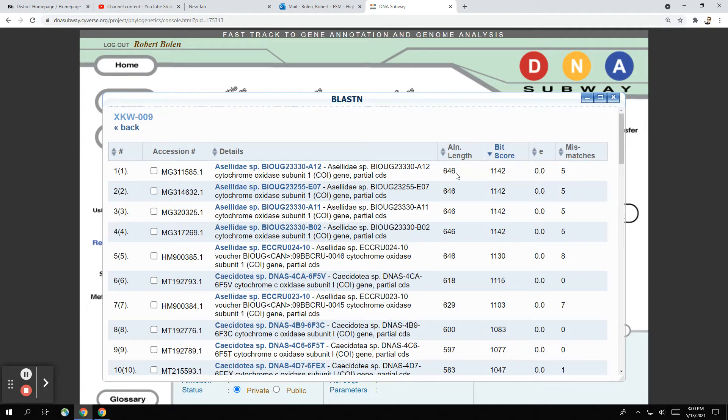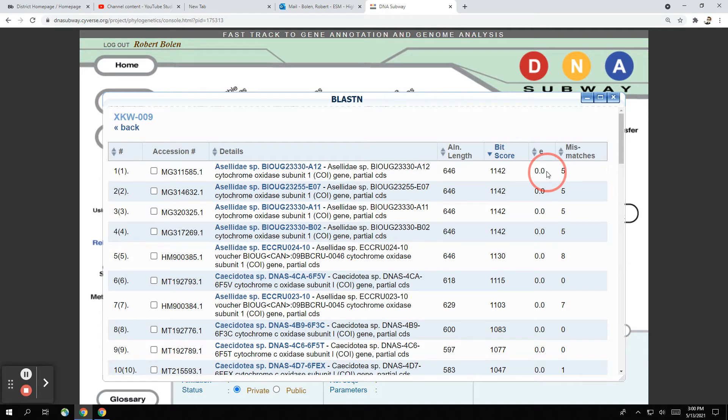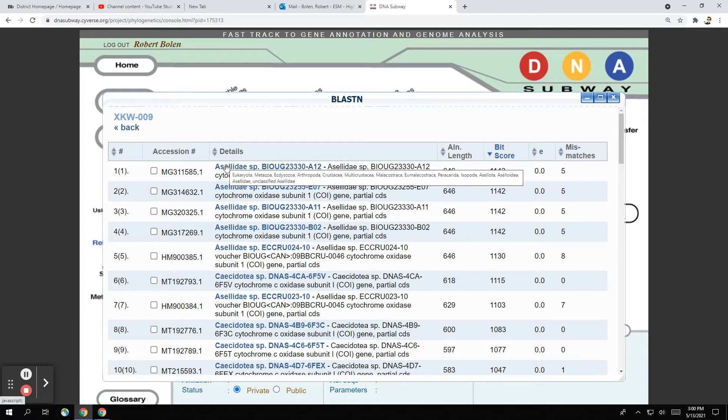This tells you how long your sequence is, this tells you the quality. The higher the number of the bit score the better quality we have. The E-value is a statistical number. If it's zero, that means that statistically there's very little, if any, error. And the five mismatches tells you how many nucleotides our top hit is different from our actual sequence that we have.